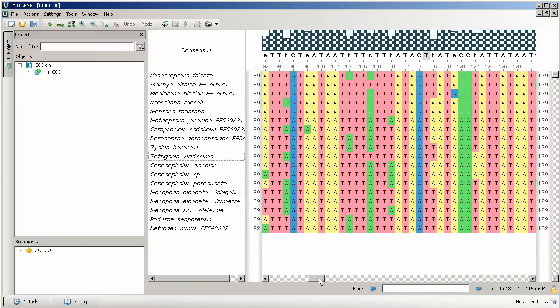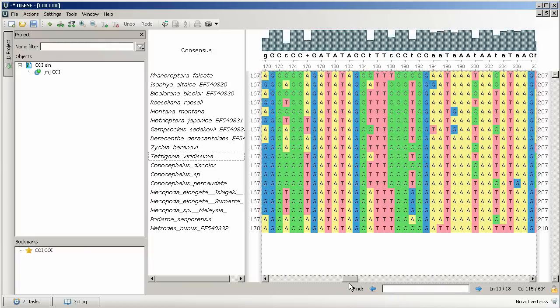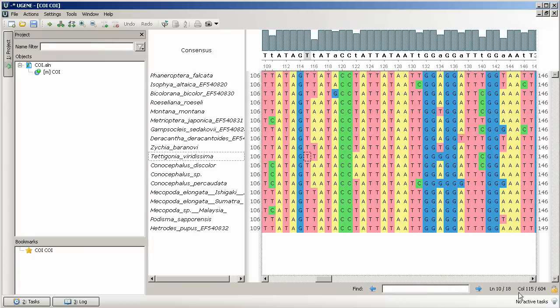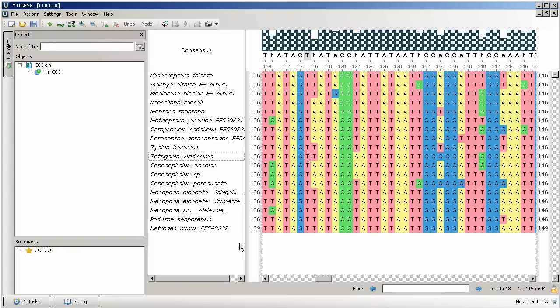If we scroll the sequences, the sequence offsets change correspondingly. However, the cursor and its coordinates remain still.